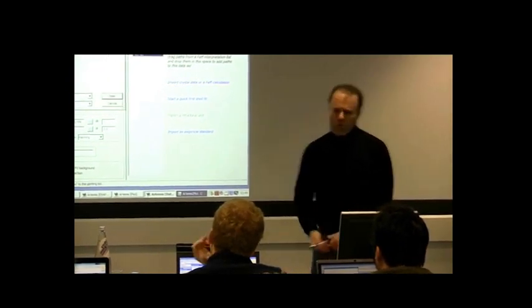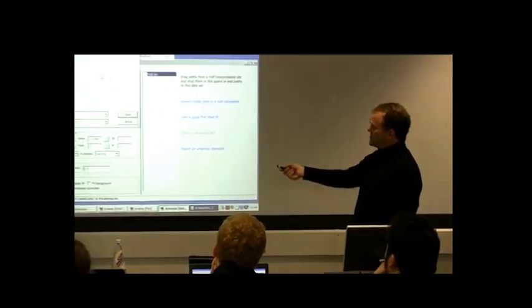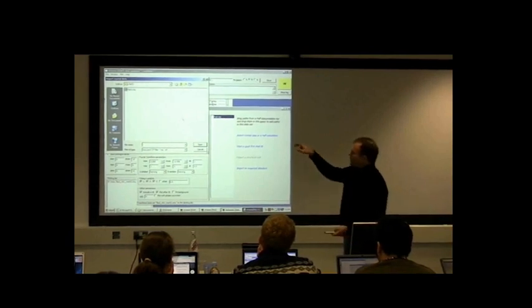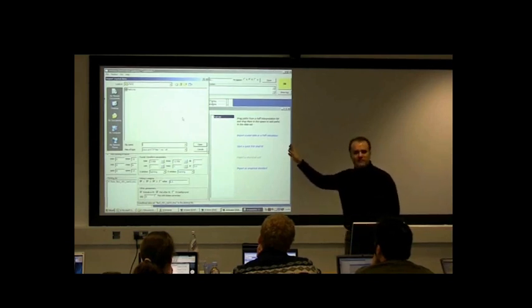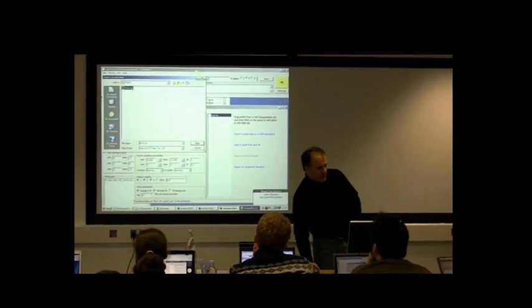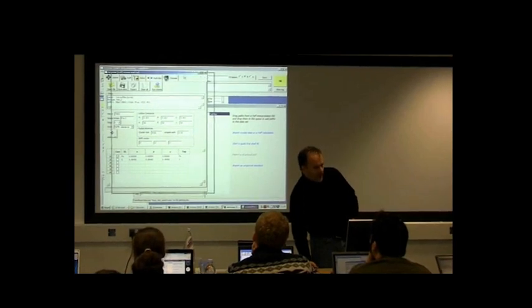What we're supposed to do, what it's looking for, is that you will navigate in the file selection dialog to a file that contains crystal input data. And this could be the sort of simple description of crystallography data that I've been using in my software for some years. You can also import CIF files if you have access to a database of CIF files. There's a bunch of things that can be read in at this point. Here is some crystal data, and now another window has opened up.